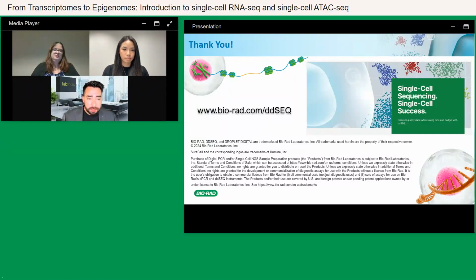It says, hello, I've been trying to process data sets that contain one control and one treated scRNA-seq and scATAC-seq data. What I want to do is compare peaks between one cluster in the control and the same cluster in the treated. I was wondering if you had any comments on which computational tool to use. So Patricia, I'll let you take it from there. There's a little bit more to the question, but I'll let you take it now.